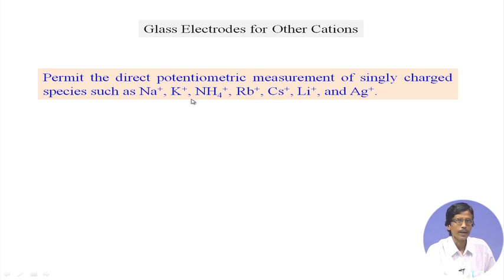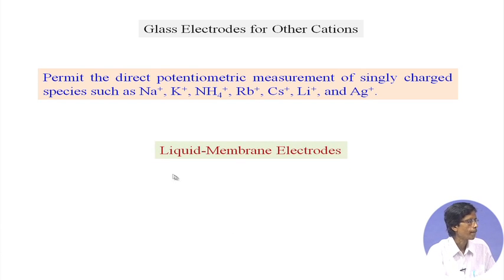So, if you suspect a solution having some concentration of these ions, even a very low concentration, the only thing you have to do is choose the corresponding electrode which is sensitive to those ions. So, the development of those things is there. Then this glass membrane is your solid membrane. The typical structure and the properties of this glass membrane are a material scientist's job, how to develop those glass membranes. So, if you find time, you can also read separately how to get those membranes.